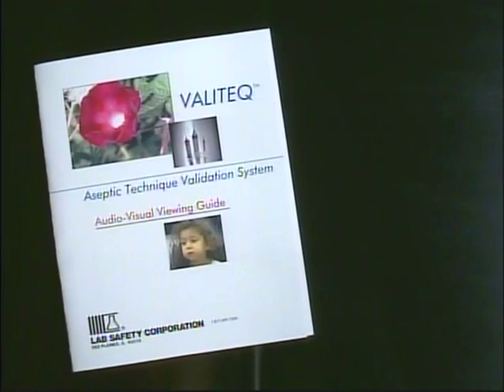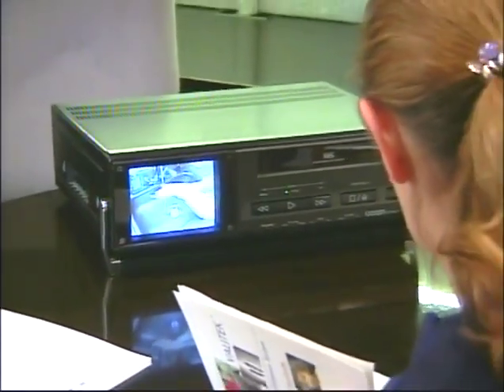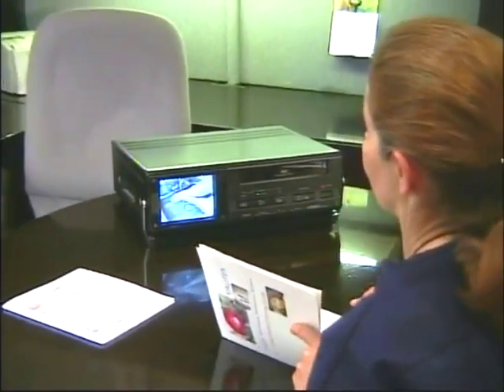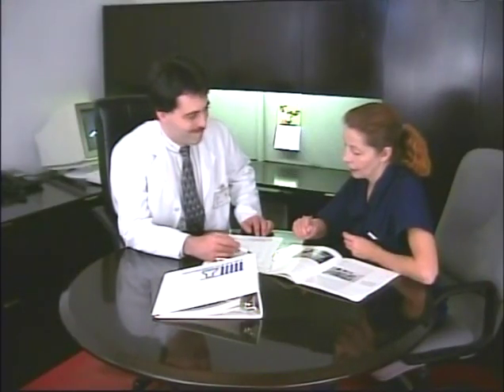The Valiteq Aseptic Technique Training Manual should then be studied in detail prior to completing the Valiteq written and practical validation exercises. It is recommended that the viewers pause at any time during and at the conclusion of each segment for a review and discussion of the material covered, addressing any questions which may arise during its presentation.